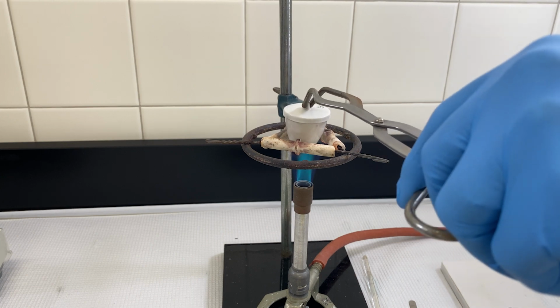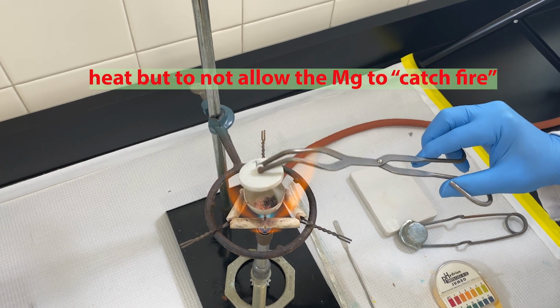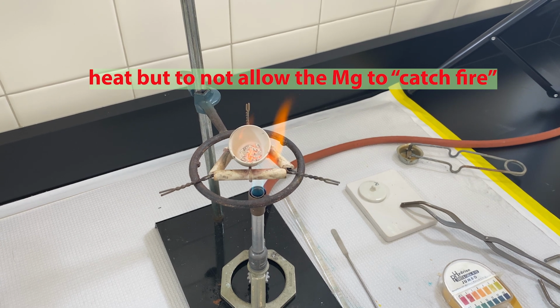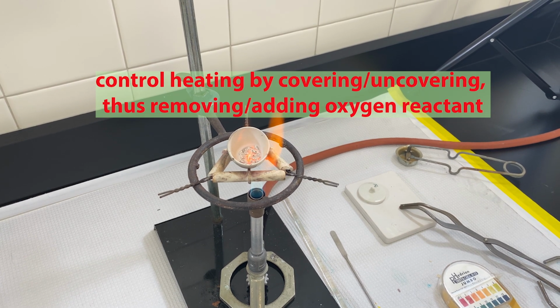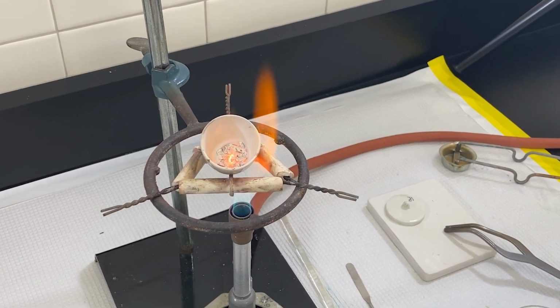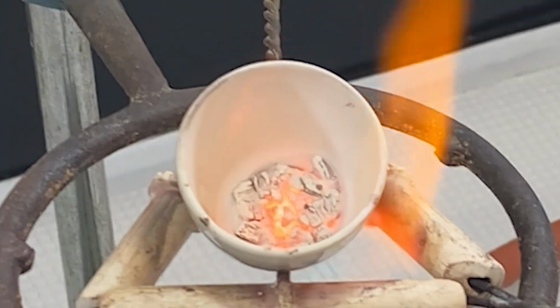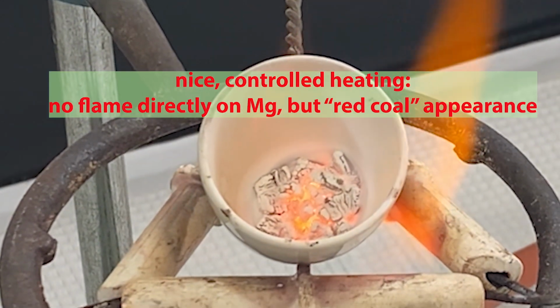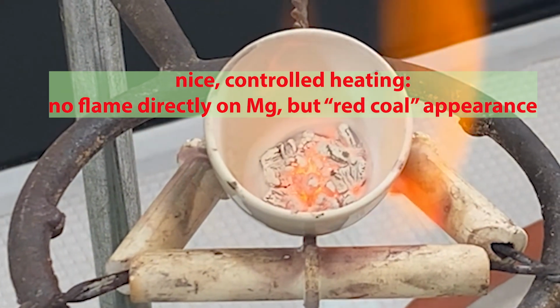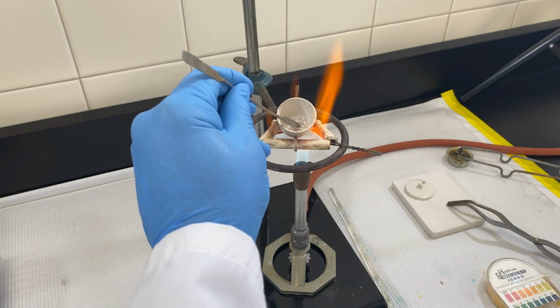We want to control the rate of our reaction so that the magnesium doesn't burn too quickly. We don't want it to actually catch fire, we want it to react relatively slowly. And we'll control the rate of the reaction using the crucible cover. If we cover the material, then it will be starved for oxygen and the reaction will slow down or temporarily cease. Likewise, if we remove the cover, it adds a lot of oxygen and the reaction can pick up speed. Hence, by merely adding and removing the crucible cover, we can control the rate of the reaction.